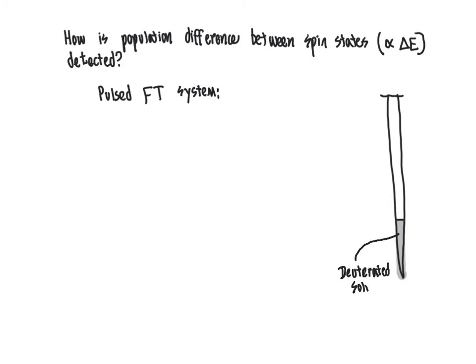So your compound is in deuterated solvent. Deuterated solvent meaning there's only minimal hydrogen 1 in that solvent, and that's important because otherwise you would see a gigantic signal for the solvent, since the NMR instrument will detect those hydrogen 1 atoms. By using deuterium instead, hydrogen 2 in other words, that solvent becomes invisible.